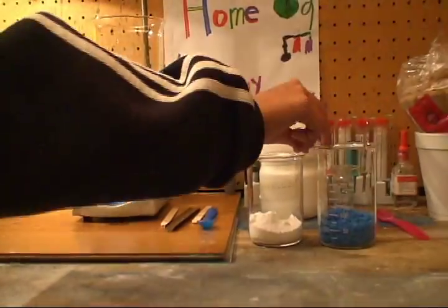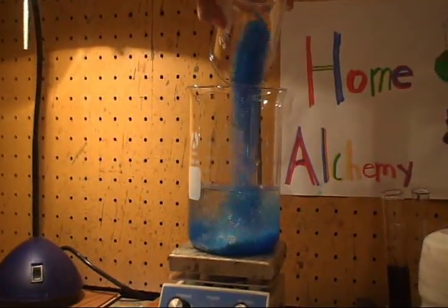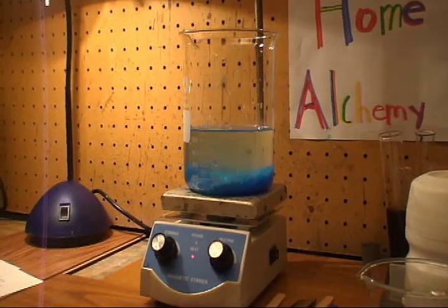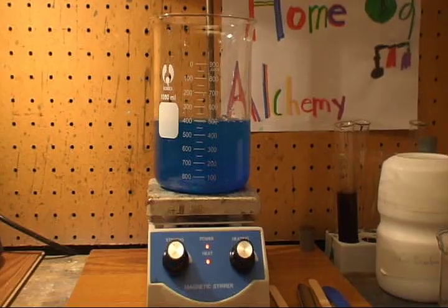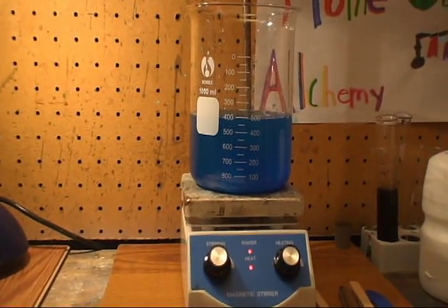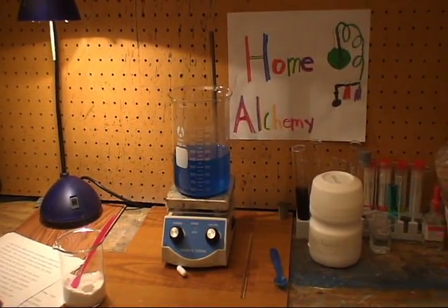Now I am going to dissolve the copper sulfate into 400 milliliters of water. I am going to use a magnetic stirrer to speed up the dissolution. Here we have our fully dissolved solution of copper sulfate in water — it's a beautiful blue color.